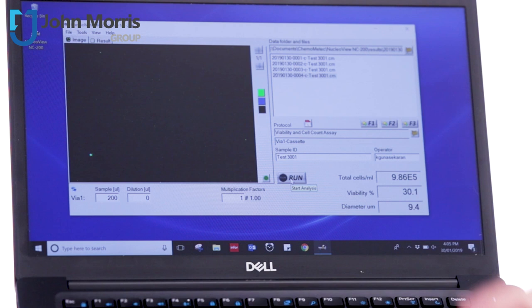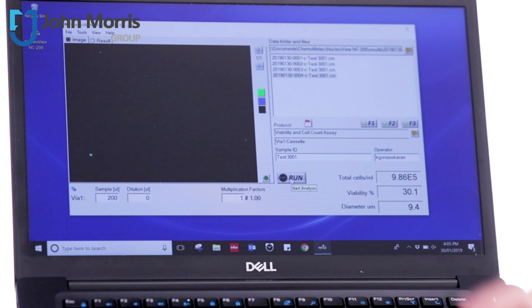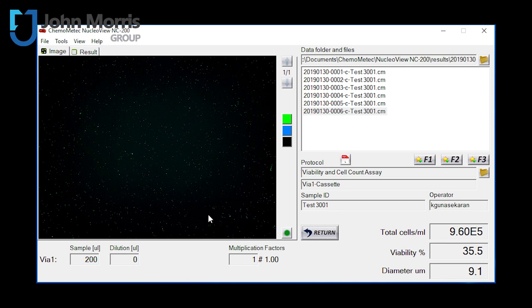So in the results here, you don't just get some very useful numbers. You also get a visual image so that you can see exactly what's going on. And here you can see me zooming in and out of the actual image.